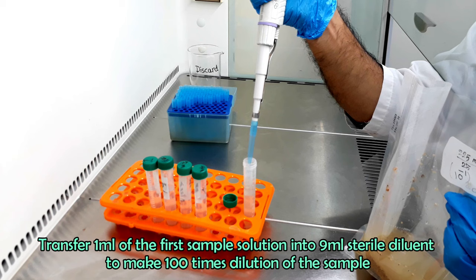By solving the equation, we got the total plate count or total viable count is 7.54 into 10 to the power 7 CFU per gram. But this result is not acceptable because the first counted dilution colony does not fall between 25 to 250 CFU. We got 762 and 734 CFU in trial 1 and trial 2, which are much greater than 250. So in this case, we have to follow second calculation.